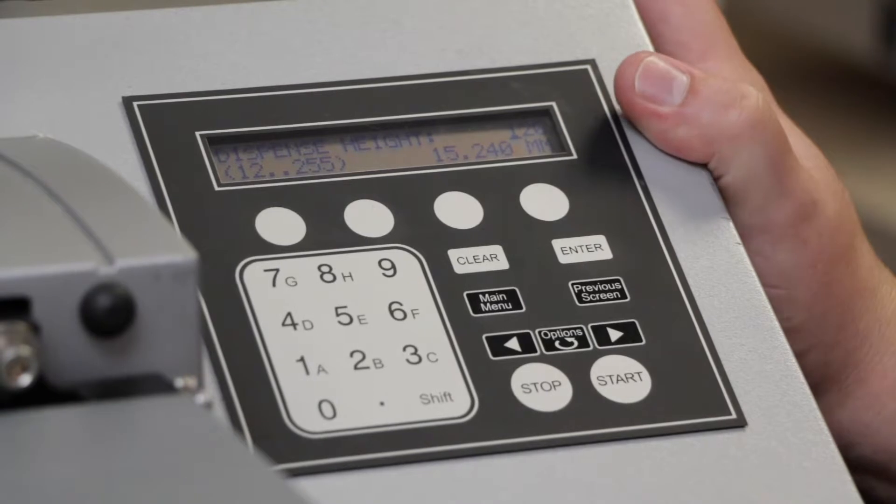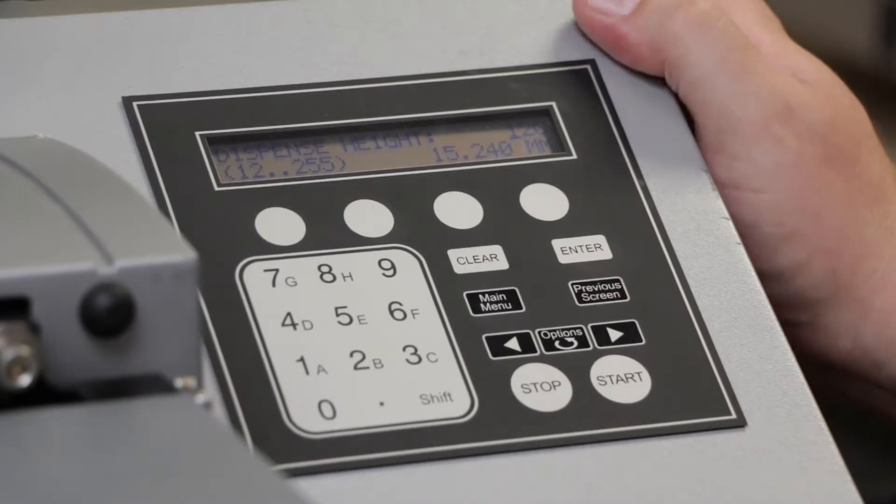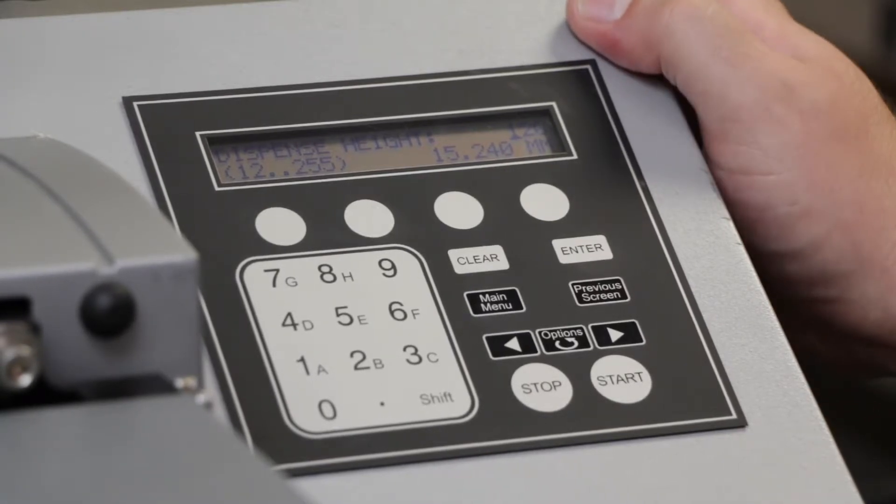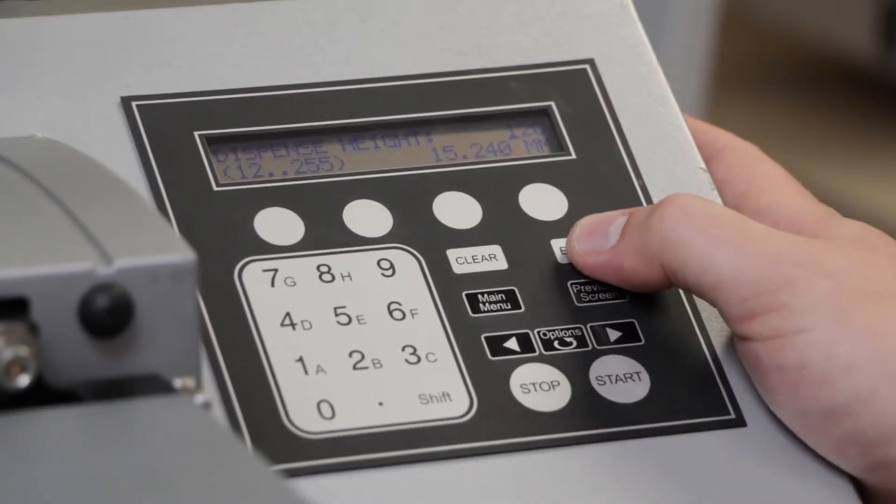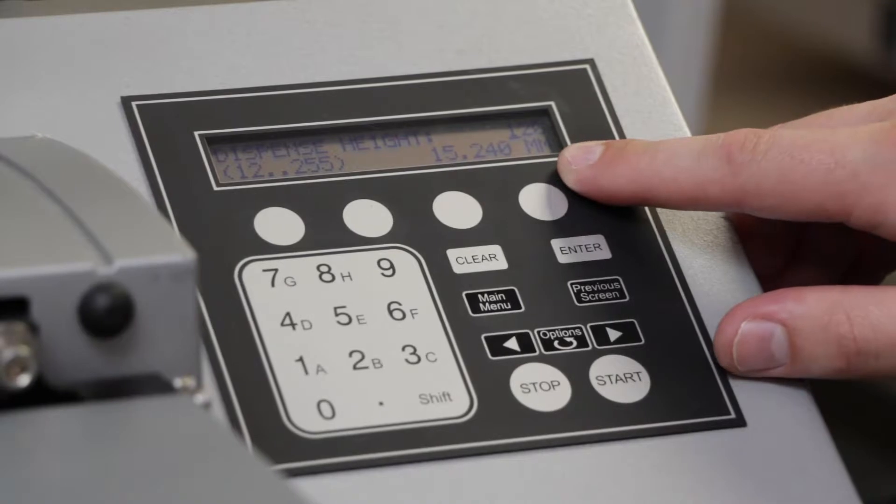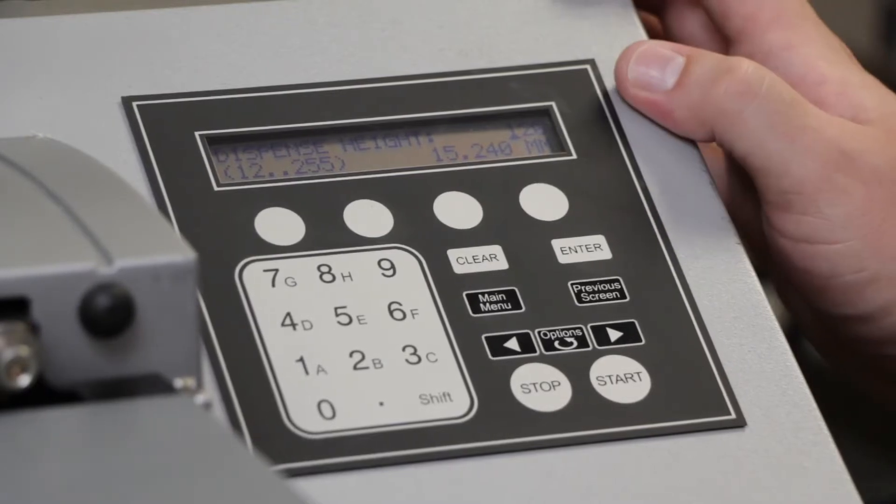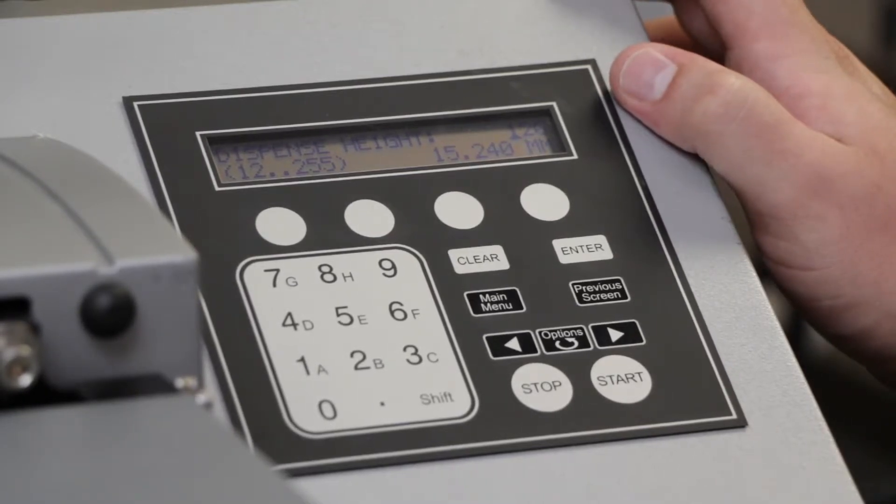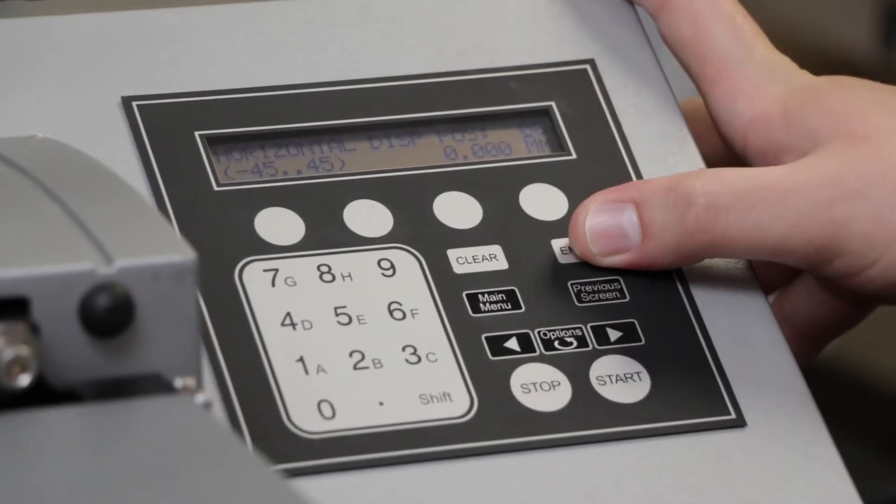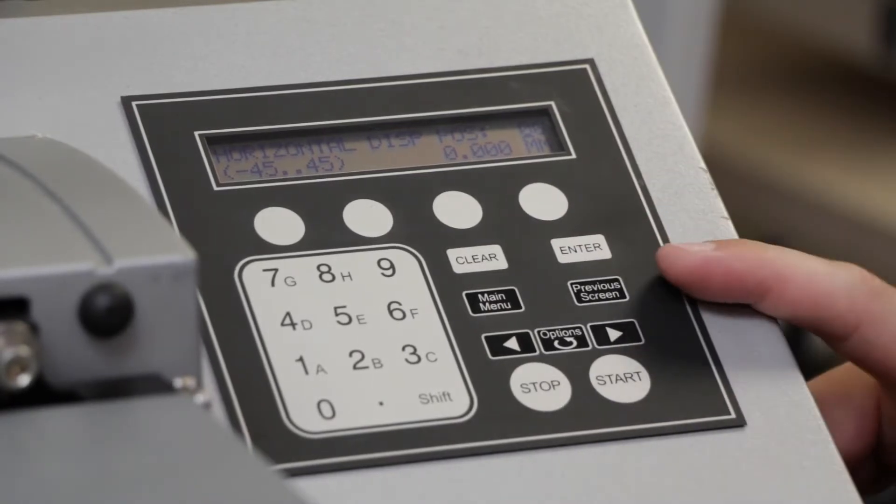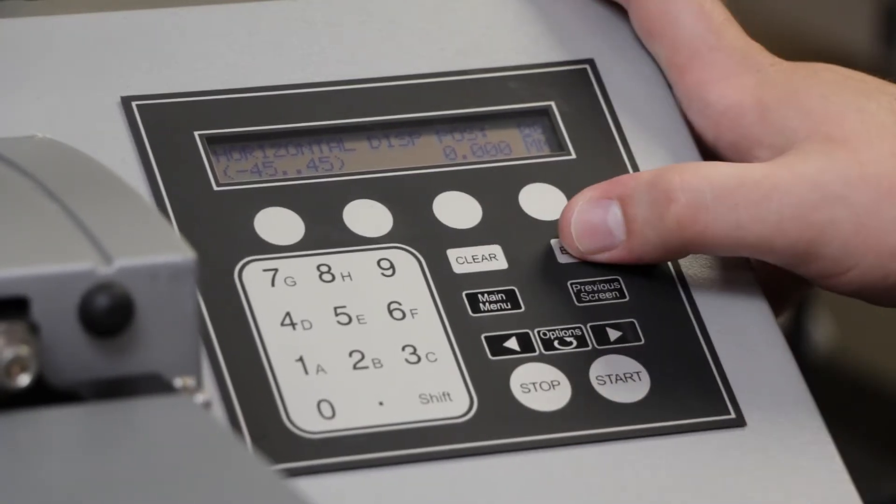And here, using information gleaned from the Adjust utility in our previous video, you can set your specific dispense height, X and Y position if you have a Select or 406 model washer. Here, we can see that we have a millimeter value for our dispense height. This is taken roughly from the bottom of the plate carrier. It'll vary based on skirt heights and different plates, so if you have the technical drawings, you can get pretty precise with your locations. You can adjust the horizontal position here. We'll leave ours at 0-0.